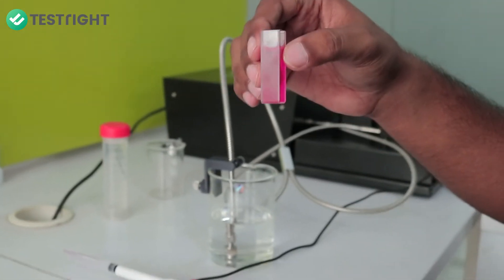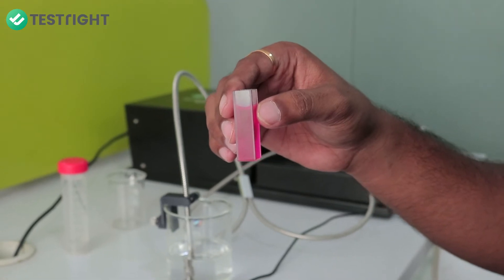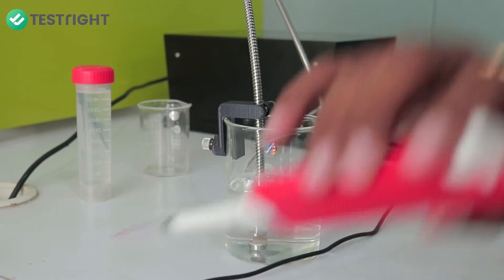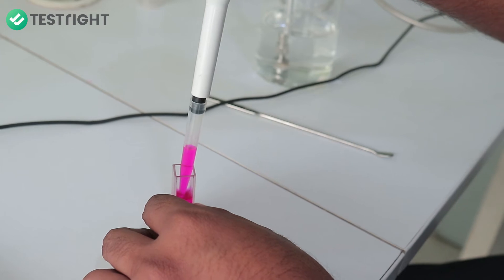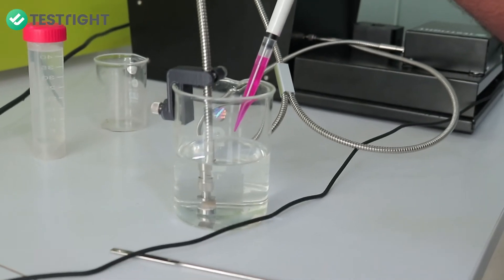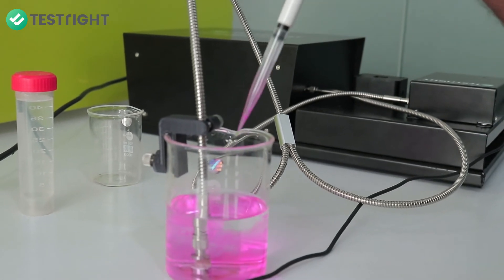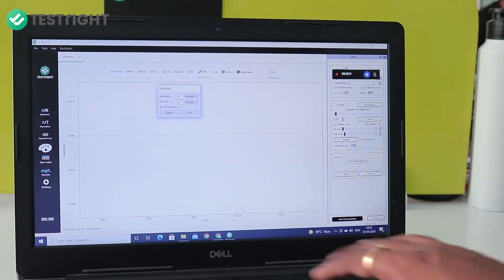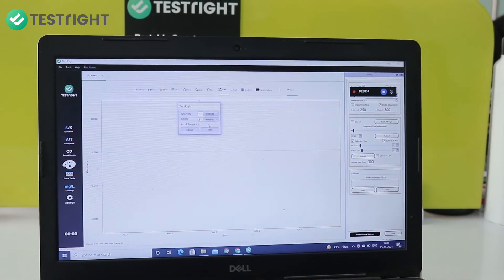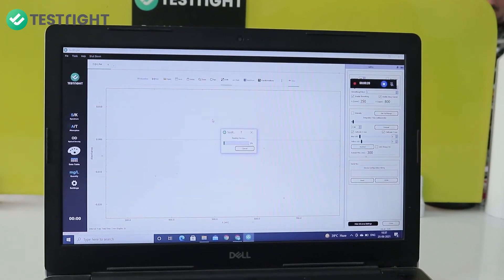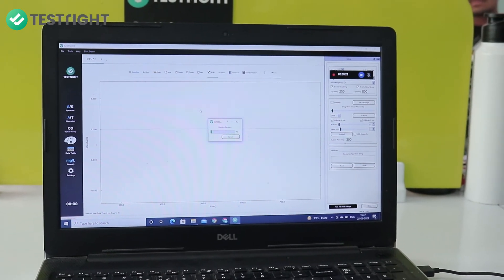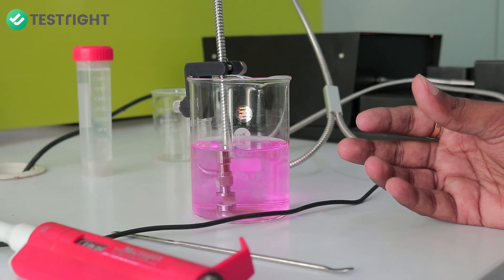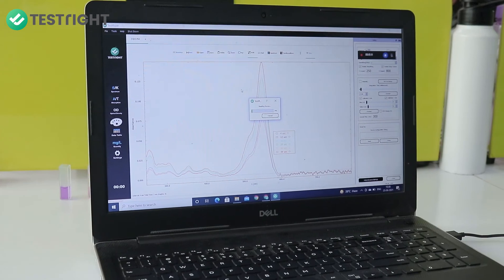Here we have a pink dye and we intend to observe how the full spectrum of the dye changes over time when it is diffused into a beaker of water. Here we have our software and I am going to change this to maybe two minutes. We get the total number of samples and then we can simply click on run. As the dye is gradually diffusing into the beaker of water, we can see that we are getting different readings showing that the absorbance is gradually increasing over time.